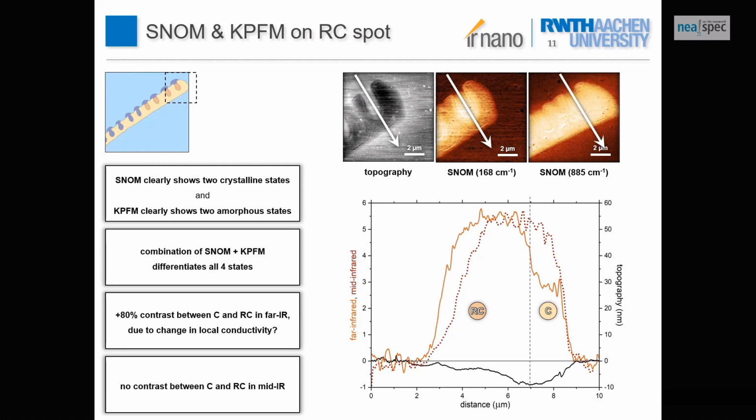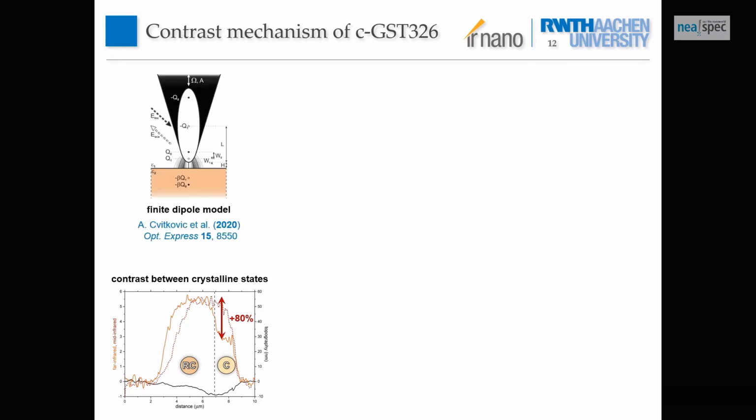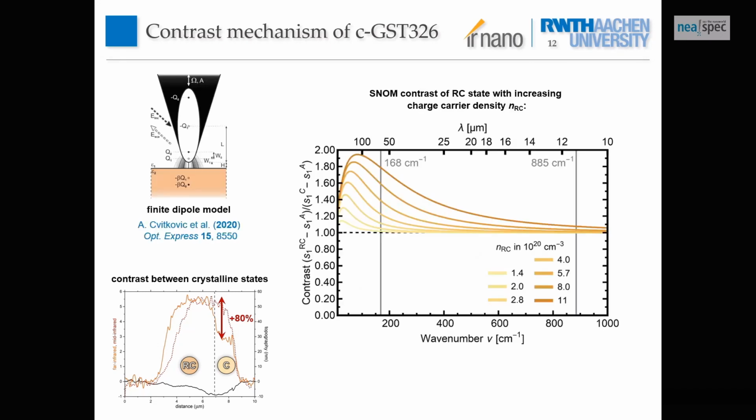But as is usual in SNOM, if you have a contrast, it's difficult to explain it with a dielectric function, so you really need to check what this actually is. So we did some finite dipole modeling of this with dielectric functions.